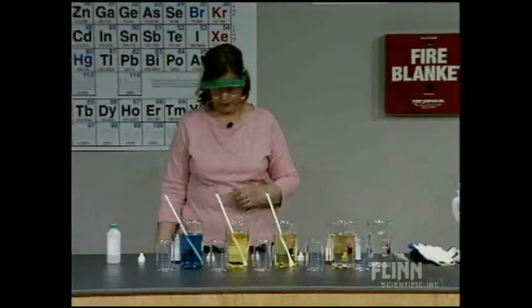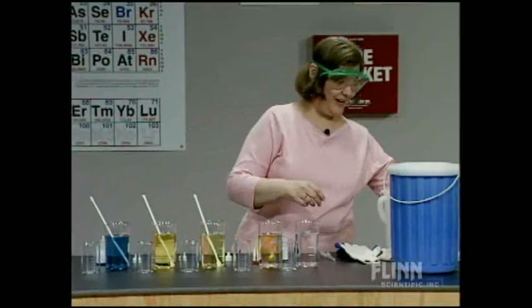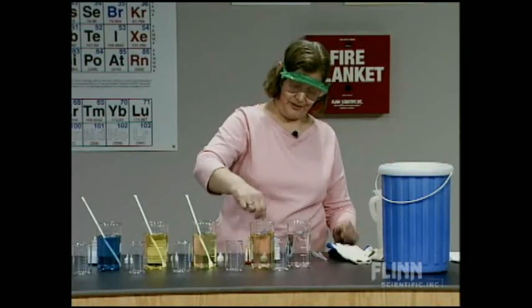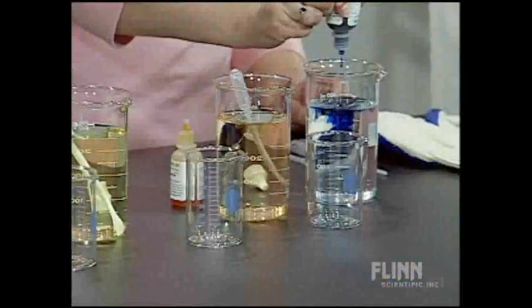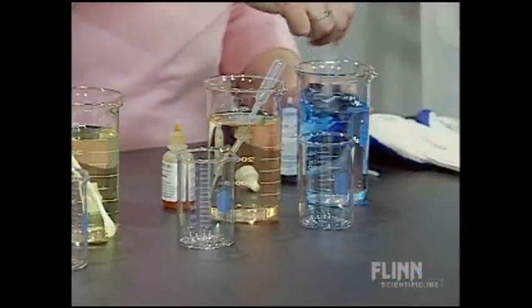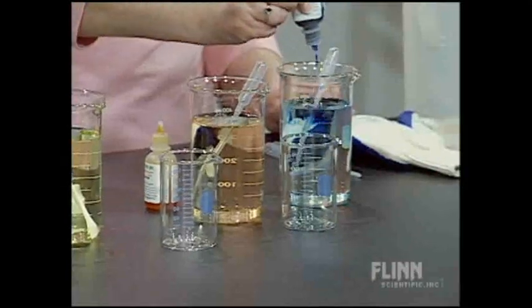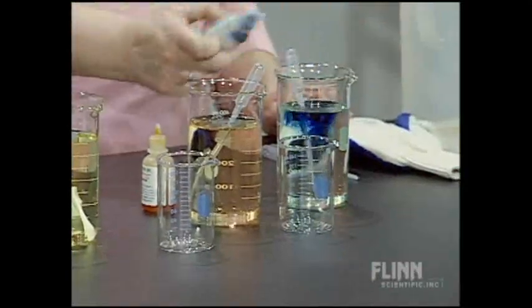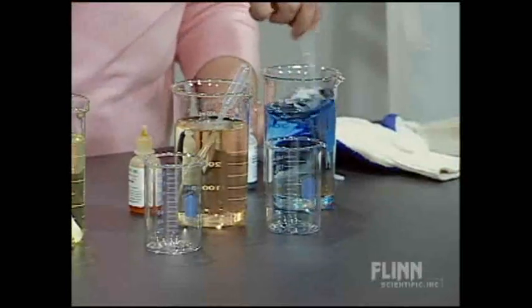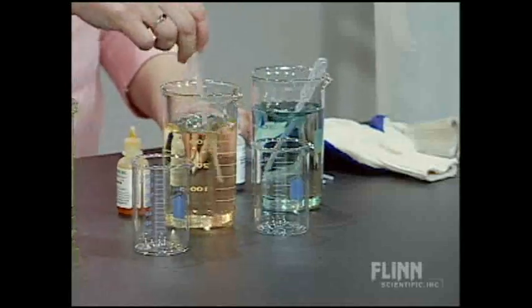I'm going to stir with my Borel pipettes. Then I've got bromothymol blue, and that is blue in basic solution. I want to make sure that I have the basic color of each one with a nice, deep color. Actually, this one is green — a greenish blue — which means it's sort of in the intermediate range.